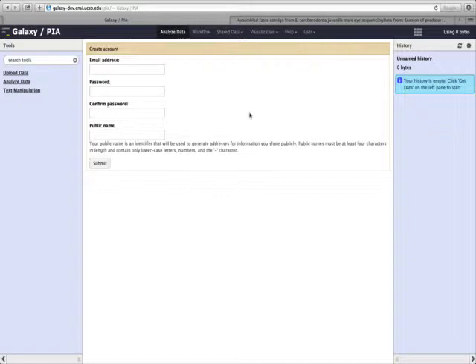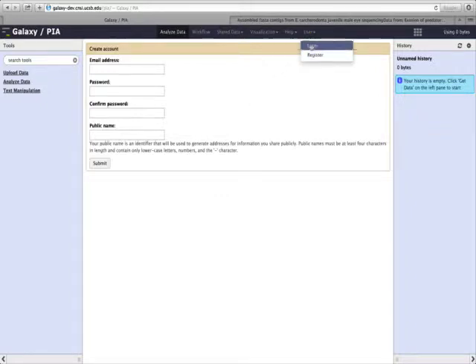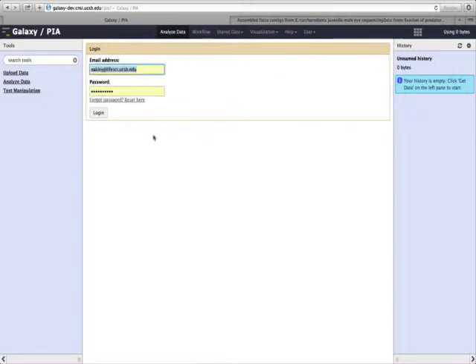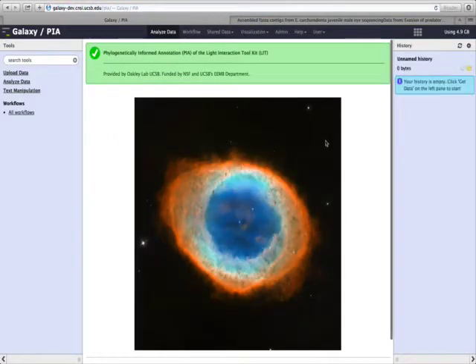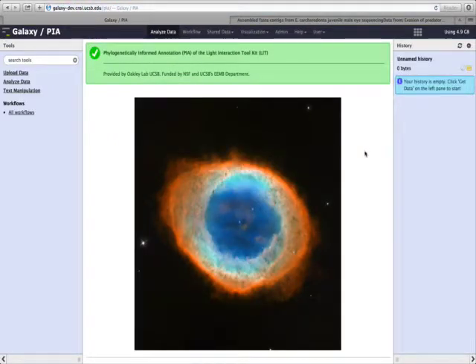I already have registered, so I will log in by clicking up here on User, and then Login, and entering my data. Now I'm logged in.